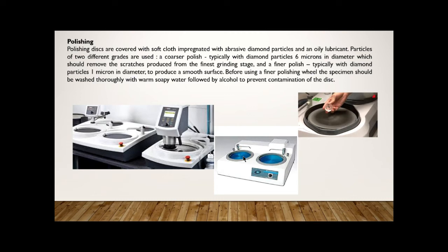Here we are going to put the velvet cloth on it. We have to put some alumina powder mixed with water over there. Then you have to keep your sample on it. You have to make the sample stationary while the disc rotates, so it will give a nice finish. At the end, you have to use diamond paste over the cloth, then you have to keep your specimen steady. As you can see, he is doing the polishing process by using cold mounting set.